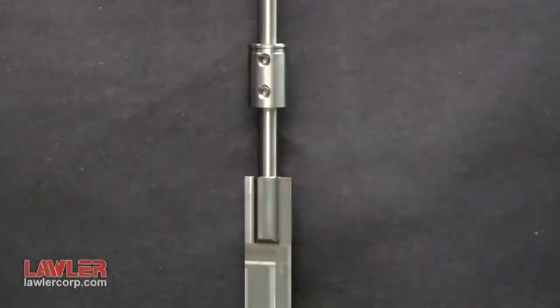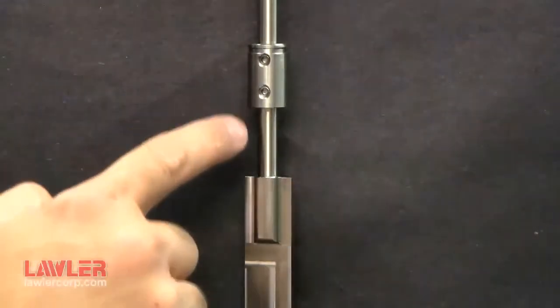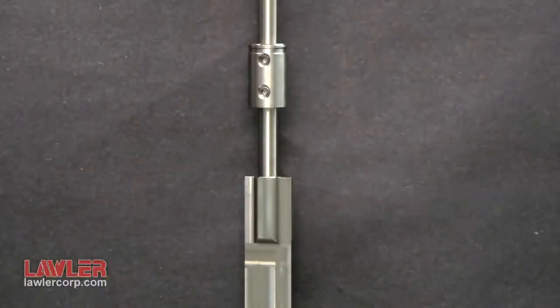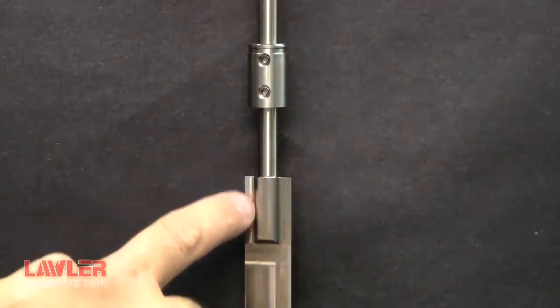The paddle and the wetted part of the shaft is cut from a single piece of stainless steel. This single piece avoids micro-crevices in soldered paddle-shaft arrangements.